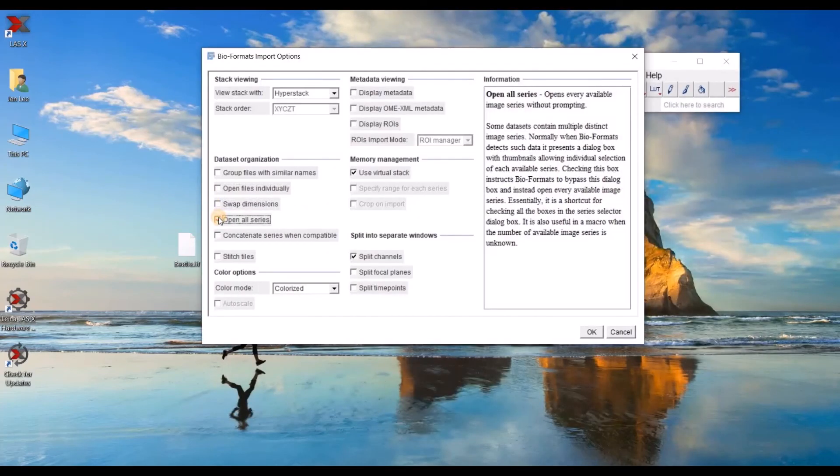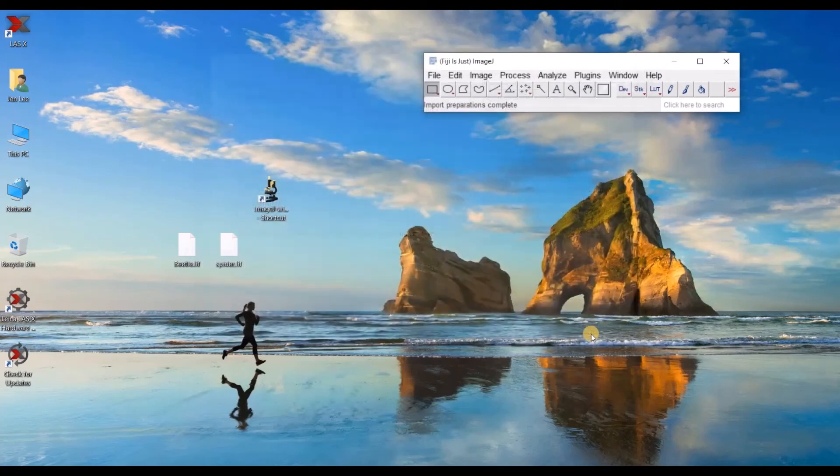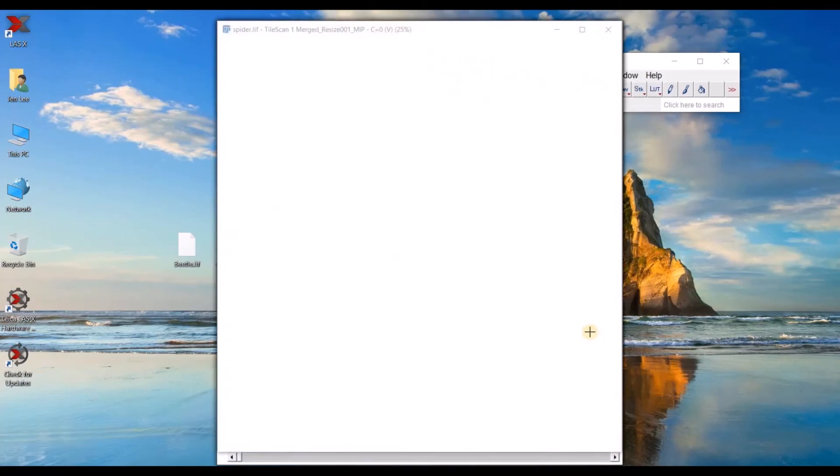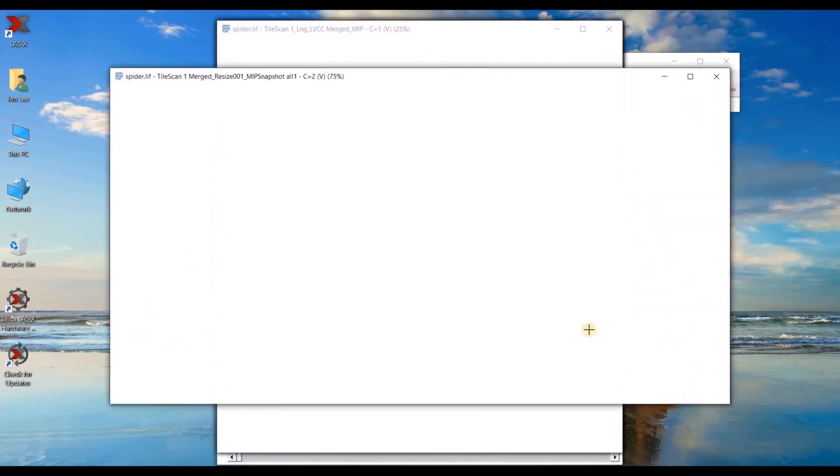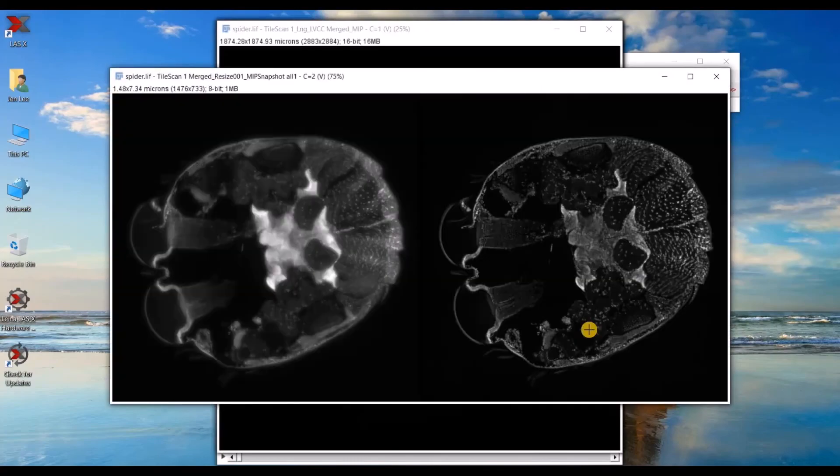So far we've opened only one file at a time. But what if we open the whole series? Let's go ahead and check that open all series box and then click OK. So now the thumbnails that you saw on the list before will open as individual files.